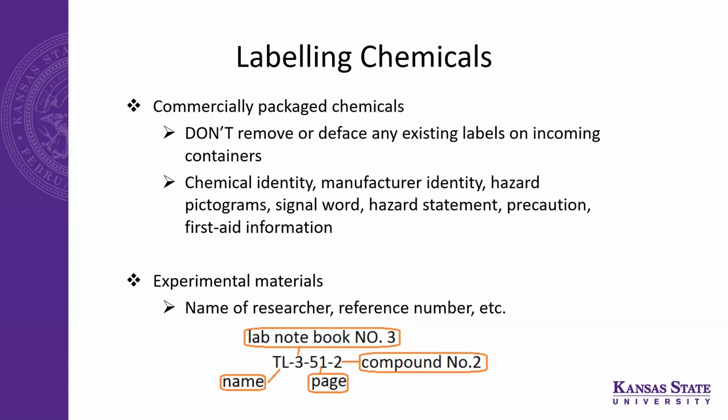Do you have a mandatory disposal time period, or does it depend? If you get a chemical in today, do you get rid of it mandatorily in 5 years, or do you just look for an expiration date? Yes, depending on the chemicals. There's no strict rule regarding disposal. Some of the departments have gone to the rule that if it comes in today, in 5 years it has to be gone.